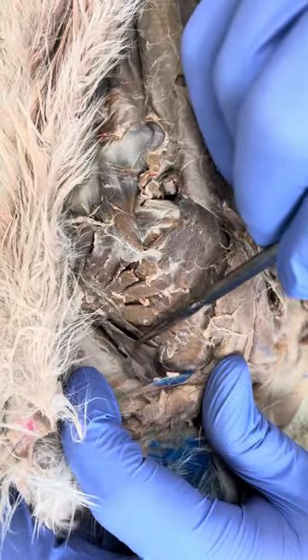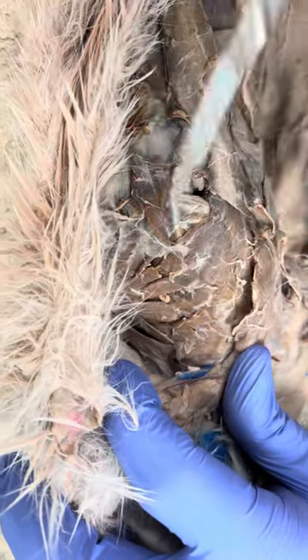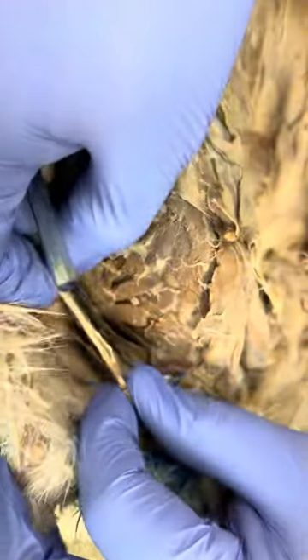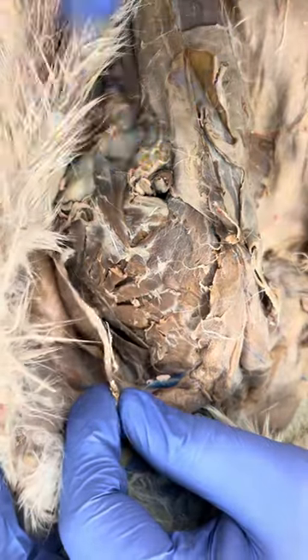If we look up here, this muscle right here is going to be my rhomboid. If you don't see it that well, don't worry — we're going to see the rhomboid when we get to the back. This is my latissimus dorsi right here, just this thin muscle that you see right here.